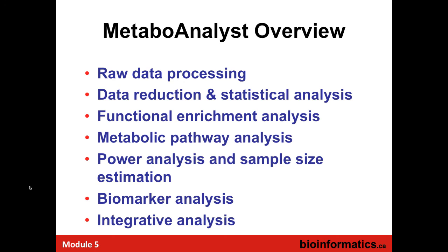So what we'll do here is talk about an overview, and then you guys will have a chance in the lab for a few hours this afternoon to give it a try. So we'll look at raw data processing. We'll look at what's called data reduction or dimension reduction and statistical analysis. We'll look at enrichment analysis, pathway analysis, power analysis, biomarker analysis, and we really won't have time to get into integrative analysis.